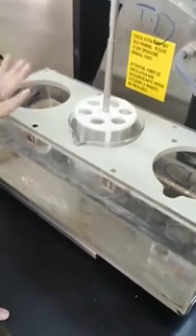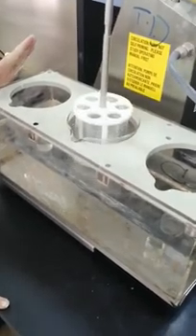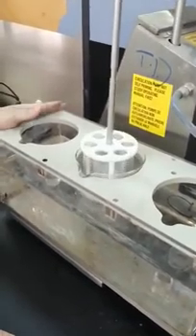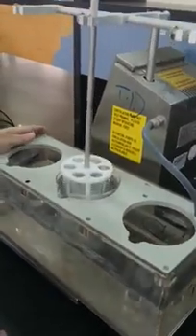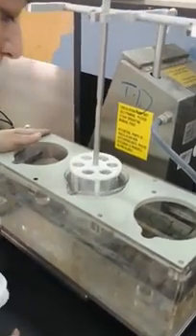So we will have 6 times, each tablet could be the same or different, and we compare it with the time required or available in the monograph of paracetamol. Once the tablet disappears, we measure the time.